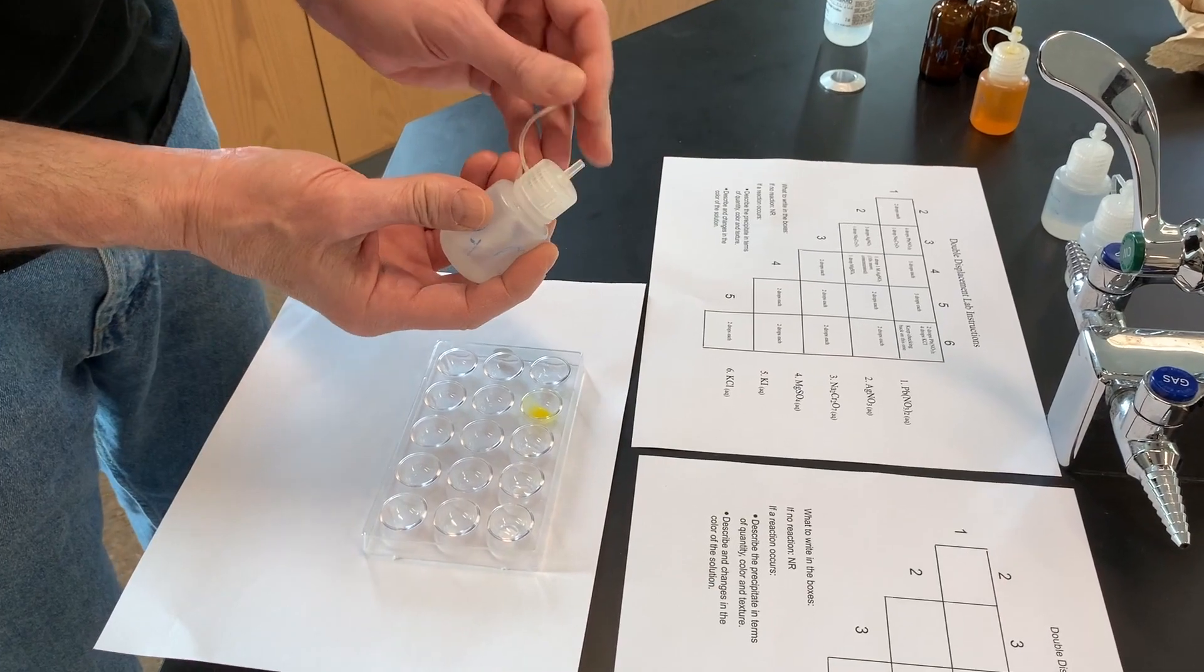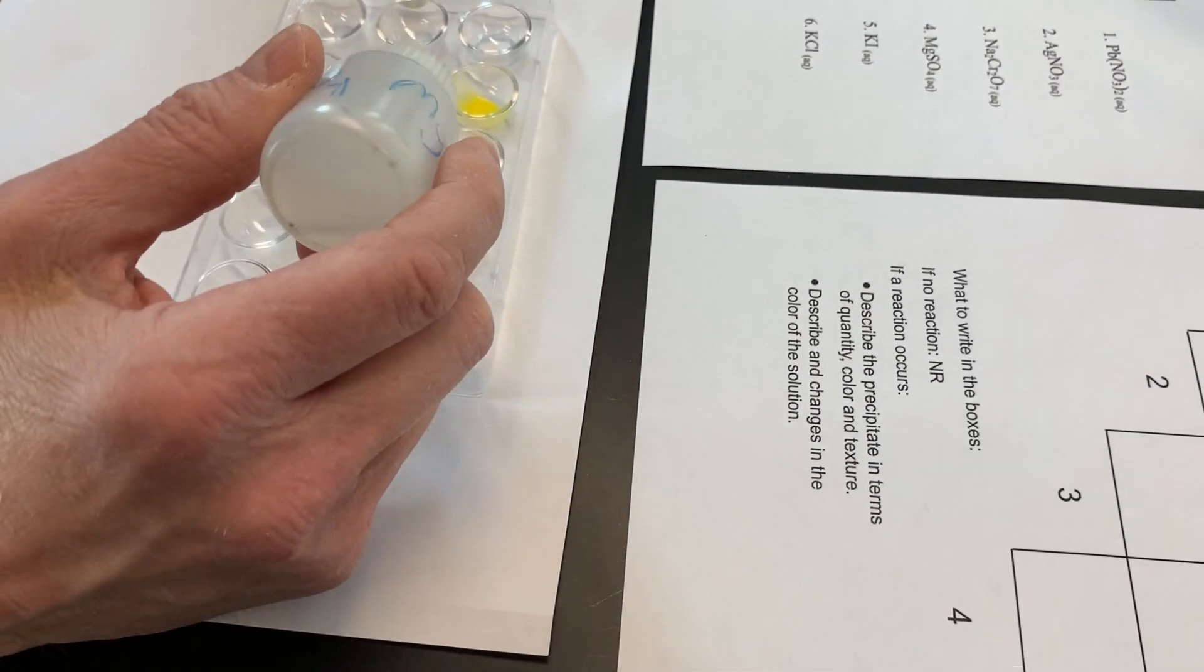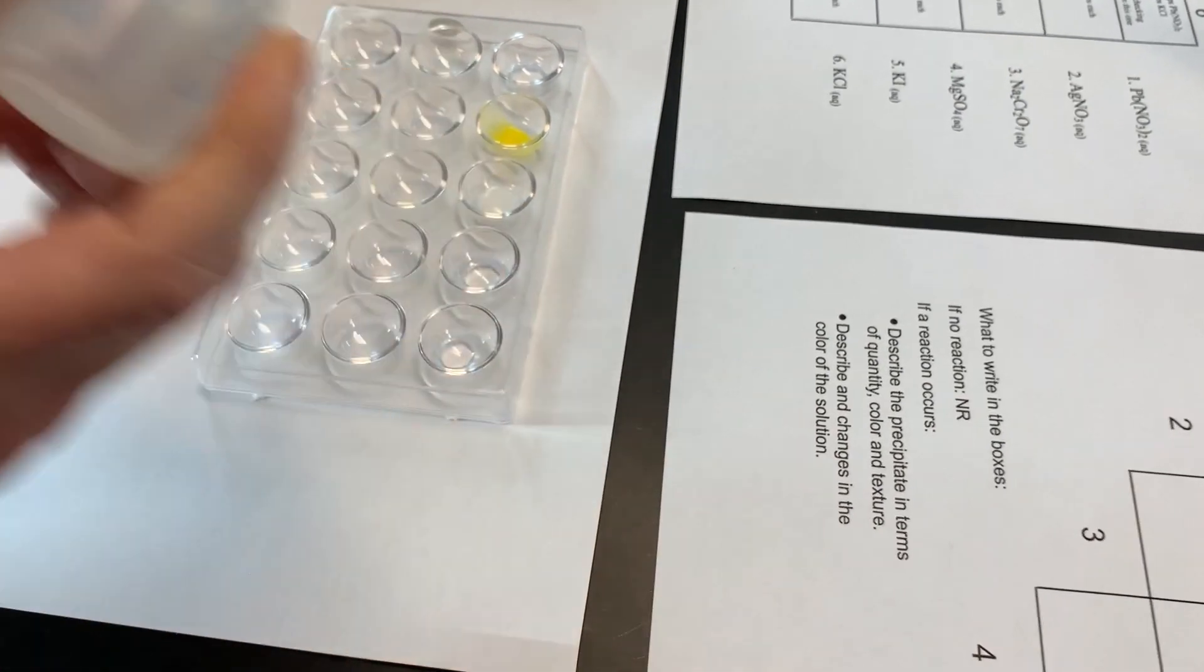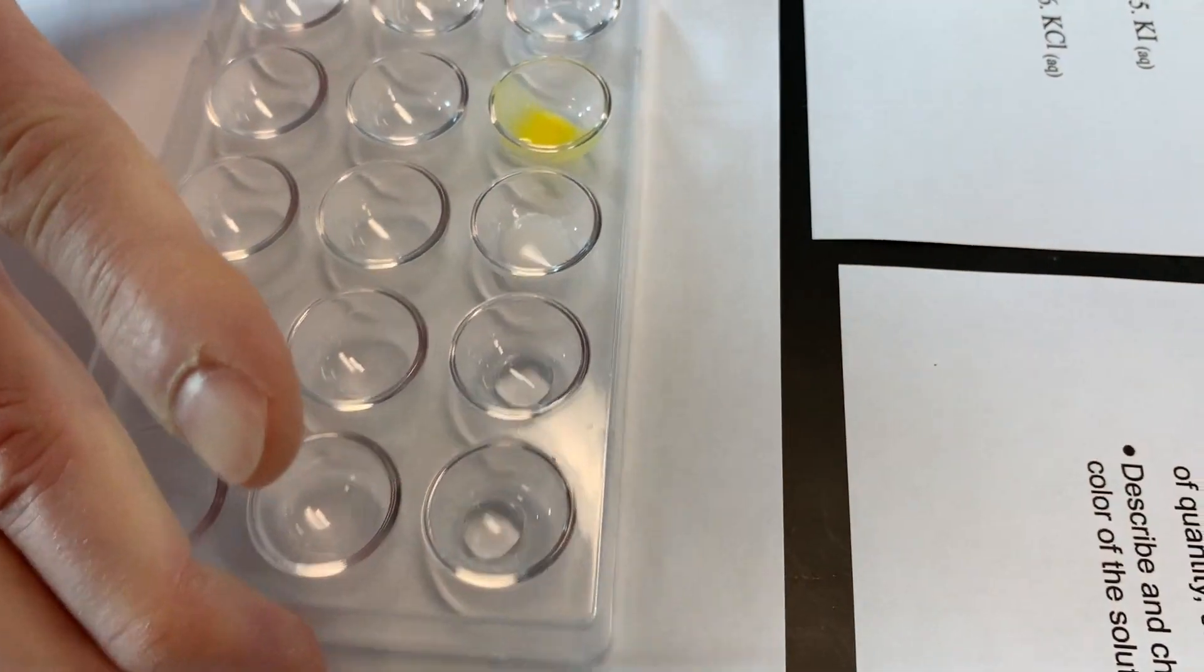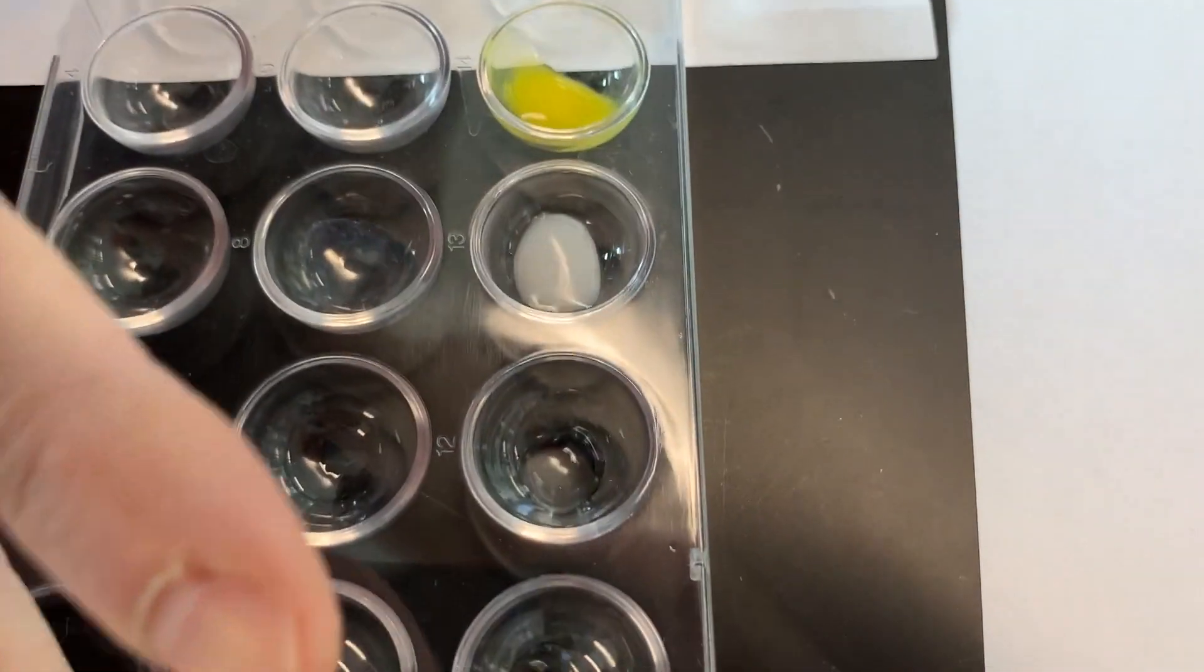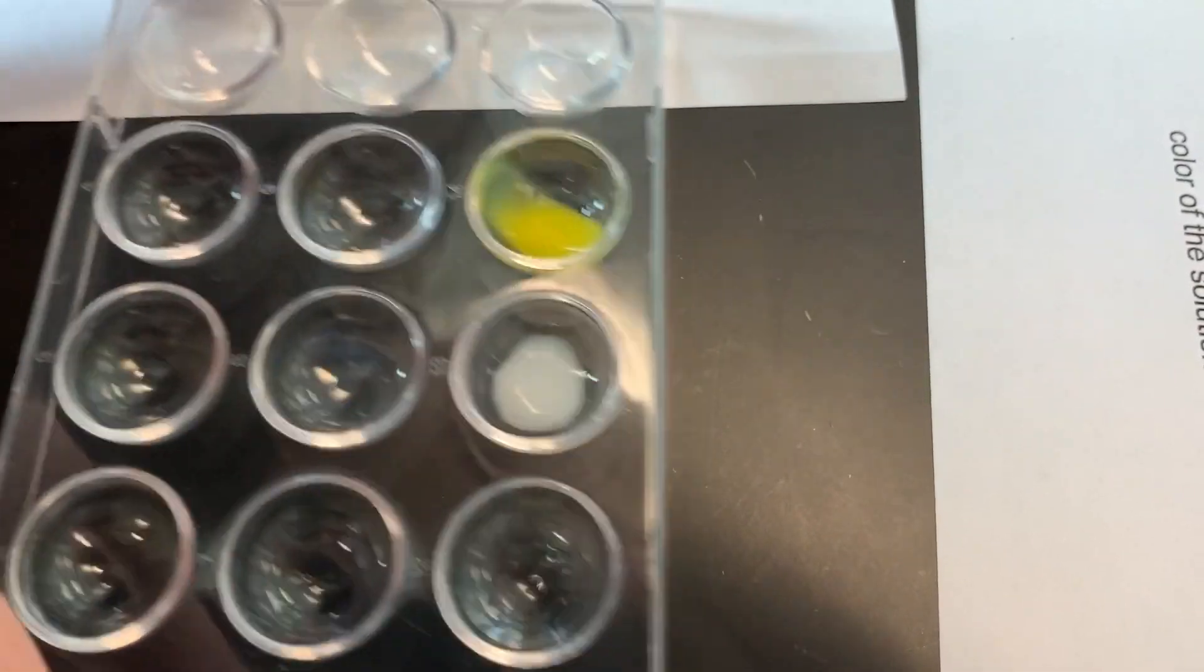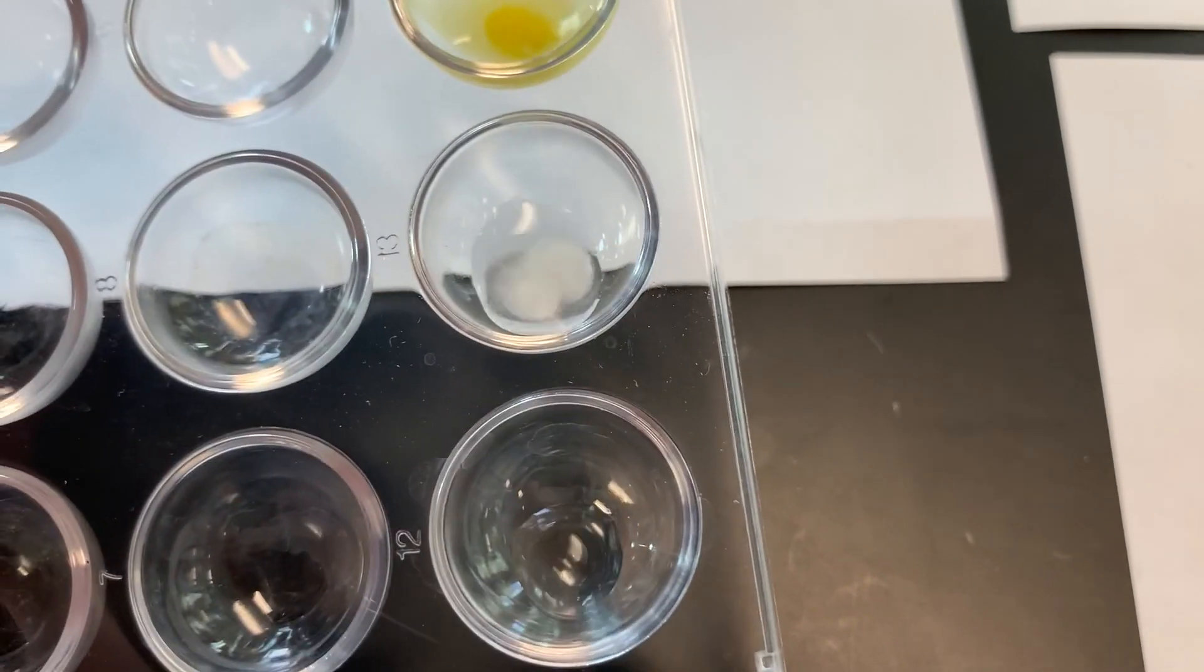Okay, so for magnesium sulfate, we're going to take three drops. Looks like some white precipitate. The liquid's definitely colorless.